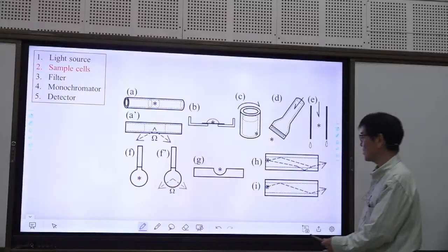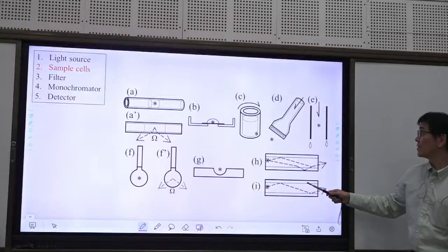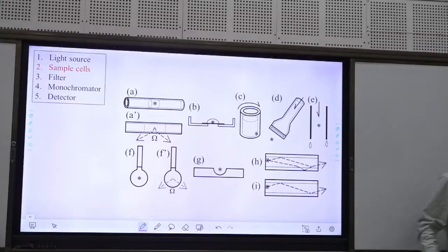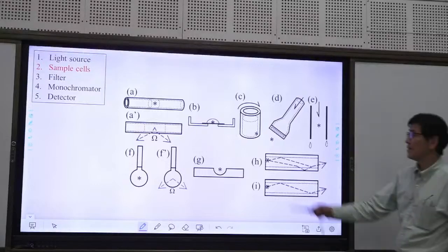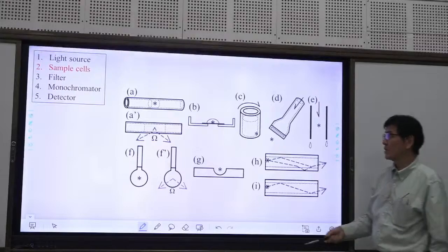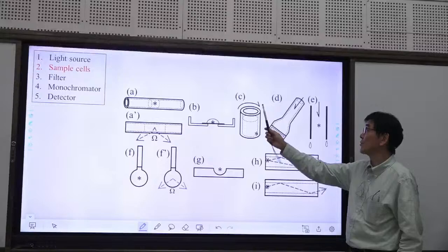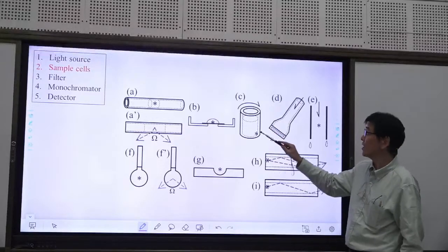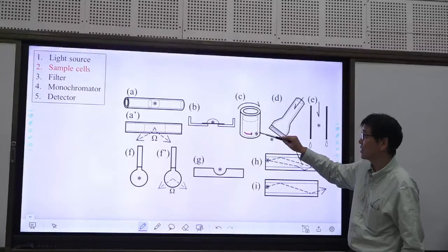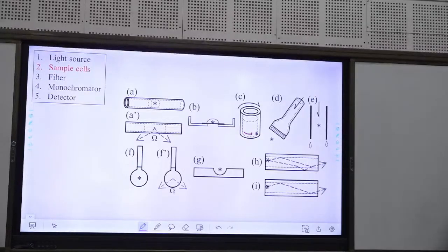Besides, there is a method to utilize the total reflection of the light. Typically, this or this are the most convenient. In the case of resonance Raman spectroscopy, the sample is damaged, so rotation cell is used, and always fresh sample is supplied onto the focal point. Then sample damage can be avoided.